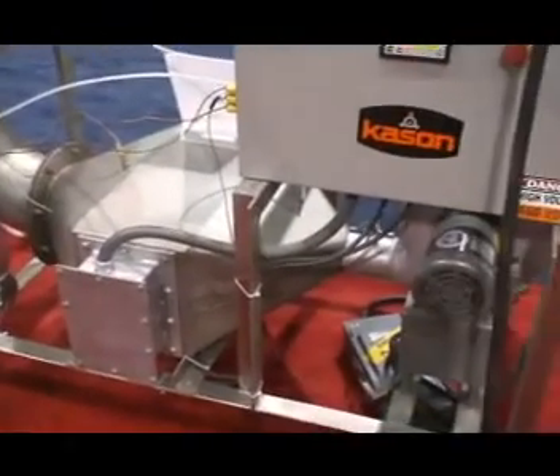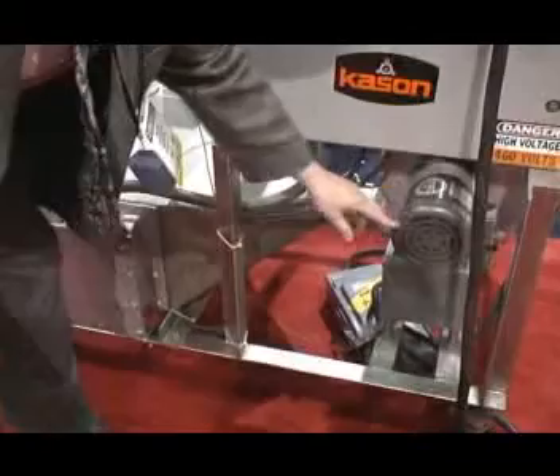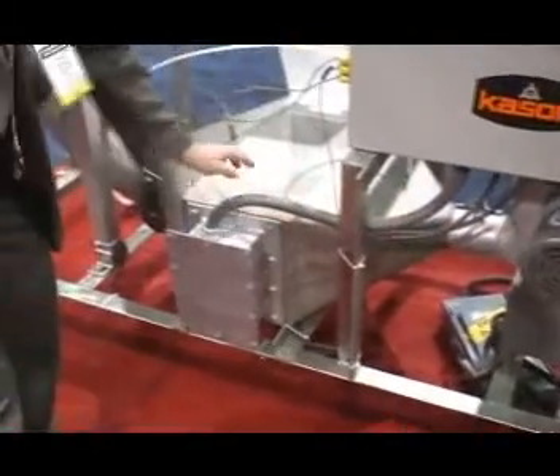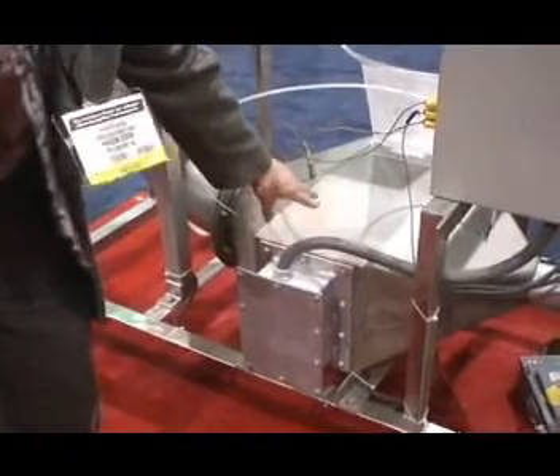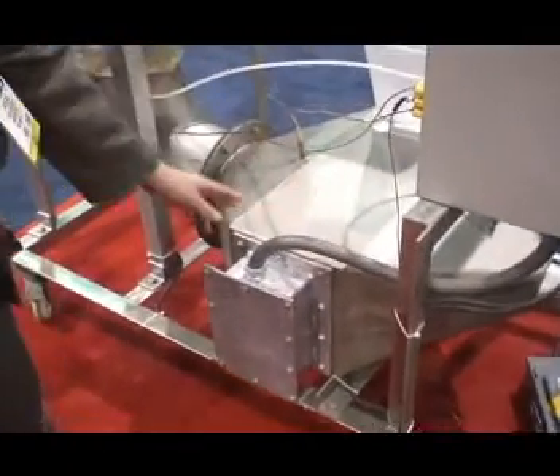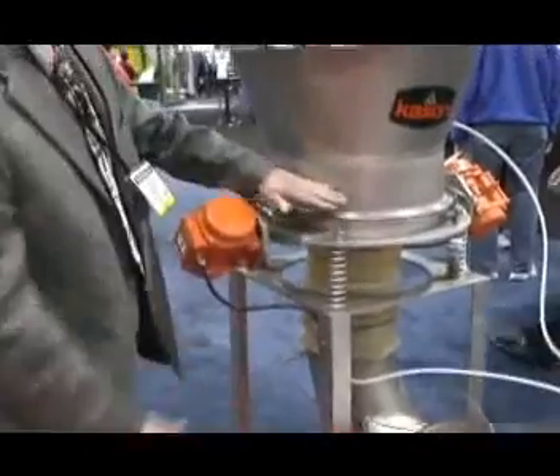The way the fluid bed dryer works, we simply have a blower with a fan. It blows air through a heated electric heater. The electric heater coils heat up, heating the air, which then comes up through the ductwork and fluidizes the material in the fluid bed chamber.